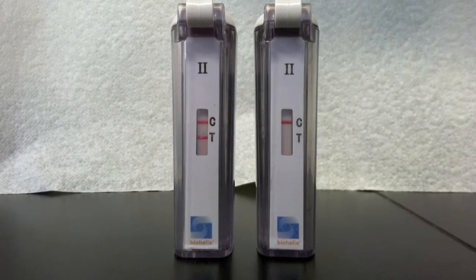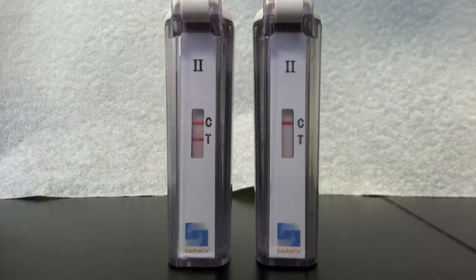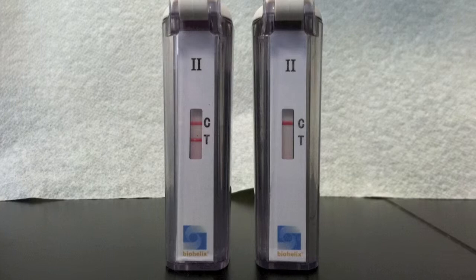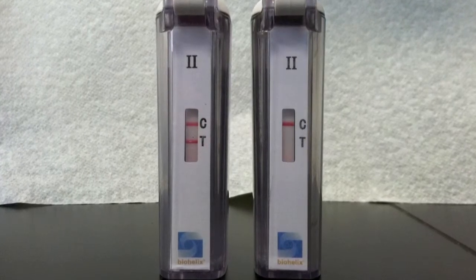When the T line is visible, it means the test is positive. When the C line is visible and the T line is not, that means the test was negative. We got positive for our positive control and negative for our negative control.